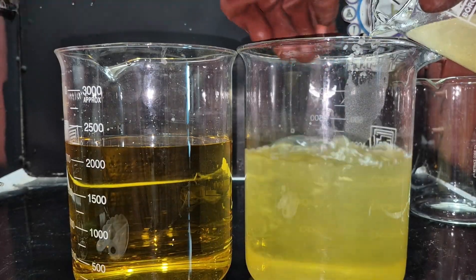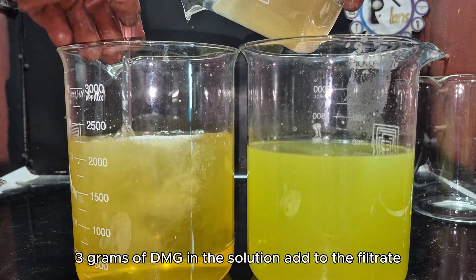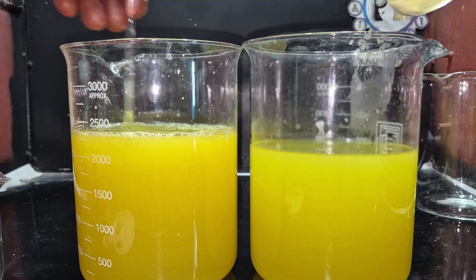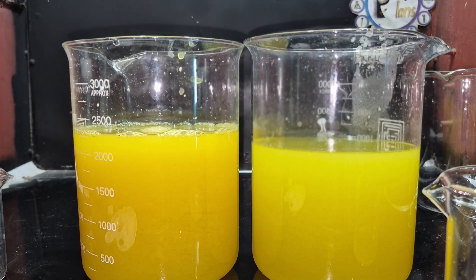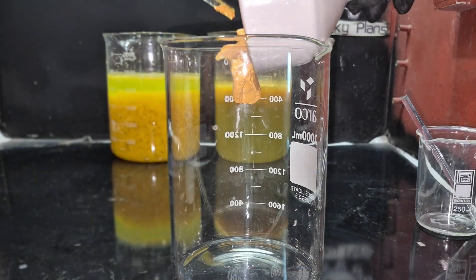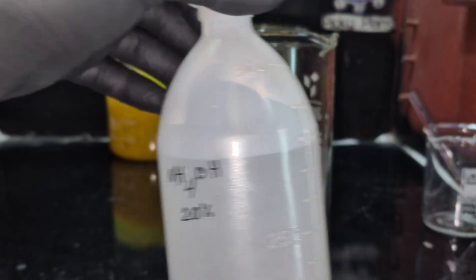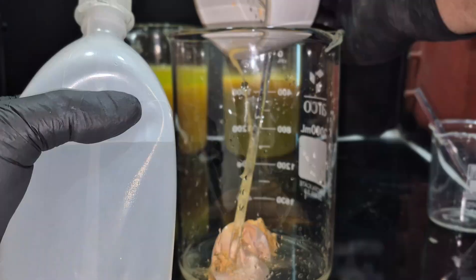I recovered the remaining palladium from the solution by adding three grams of DMG. I then transferred the palladium diamine chloride salt to a beaker and rinsed the funnel and filter paper with ammonia solution to ensure complete recovery.